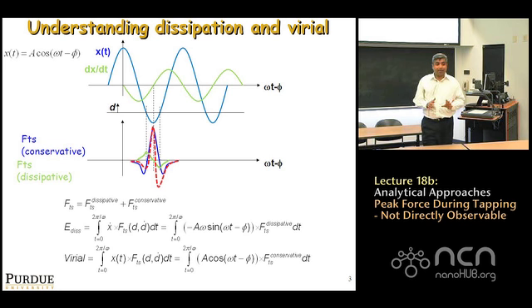That's one. Secondly, they don't even make the distinction between plotting sine of phase and cosine of phase. If you want to do some quantitative understanding of whether dark spots mean double dissipation compared to another area, if you want to know those kind of things, you've got to plot sine of phase and cosine of phase, okay, separately. Very important. Nobody does it.